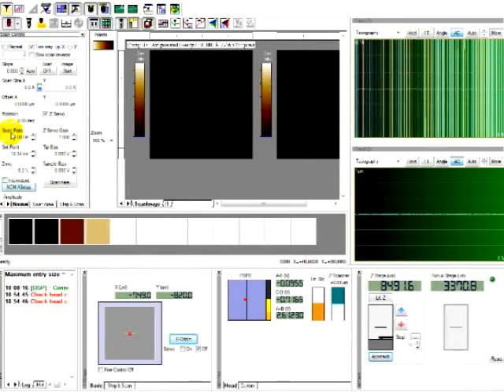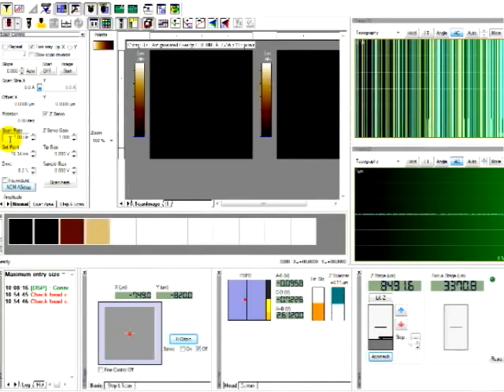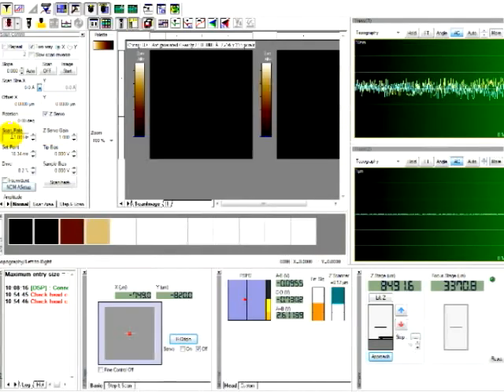In non-contact mode, there are three major parameters that we need to control: scan rate, Z-servo gain, and set point. Set point is a little bit hard to control for beginners, so we have developed a new technique called double approaching, which is where you approach twice. First, you need to lift the Z stage, so the Z scanner won't be able to feed back any signals. There you go. There's still signal.